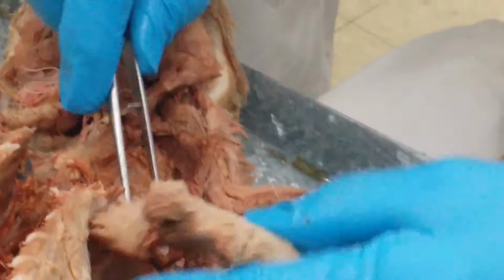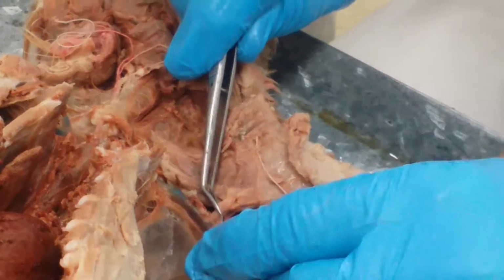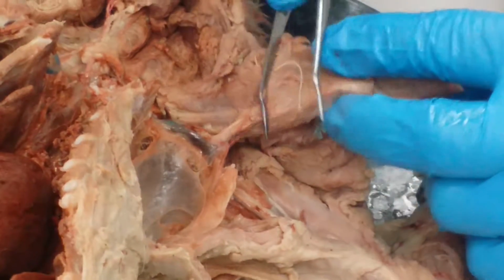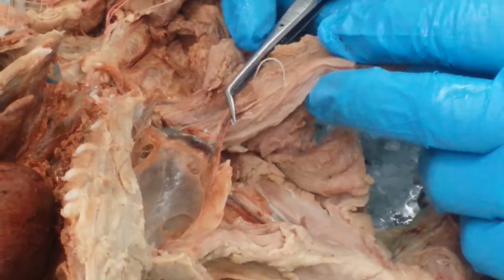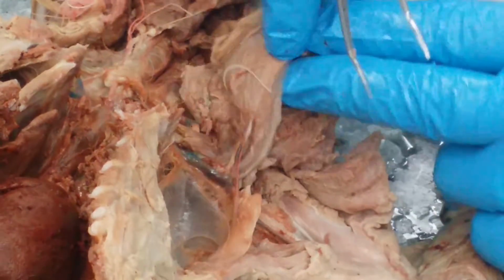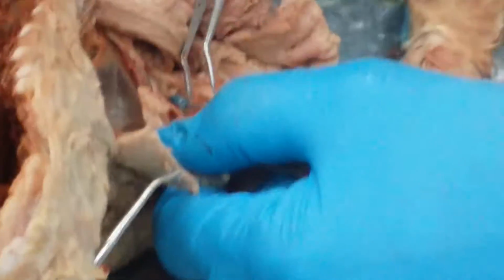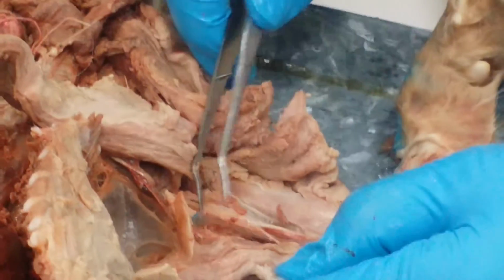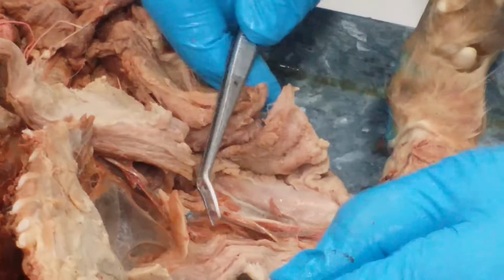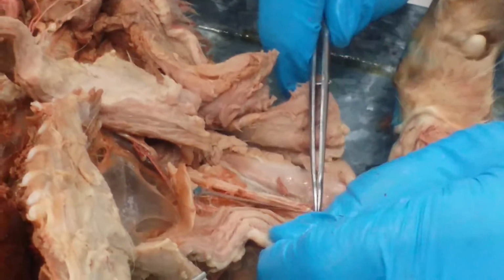And in this group of tissues here, you have the third part of the axillary region that is known as the long thoracic. Then it continues beyond that point as the brachial. So this is the brachial once those 3 branches are identified.